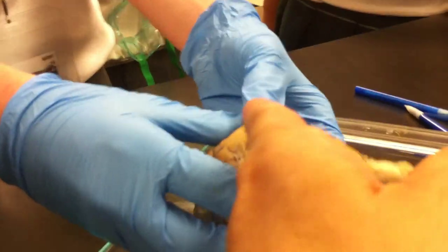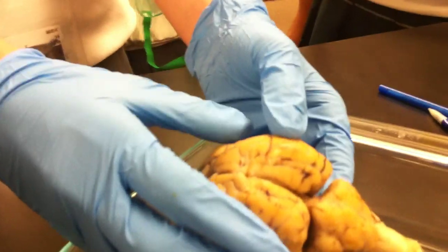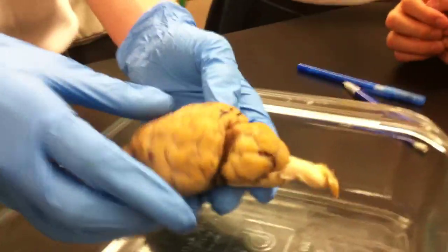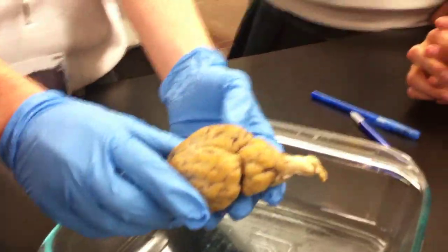Does anybody know what this is called up here, that big part? The cerebellum? No, the cerebrum. Oh, the cerebrum. Okay, what is it called? Cerebrum. Yeah, it's cerebrum. Absolutely right. What kind of brain is this, so that our audience doesn't think we removed this from some student down the hall? It's a sheep brain.